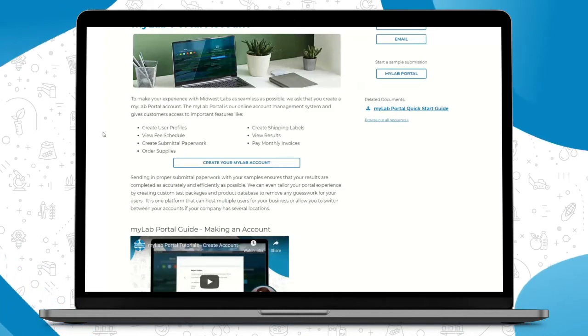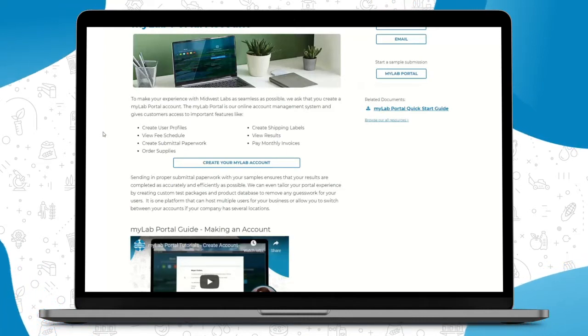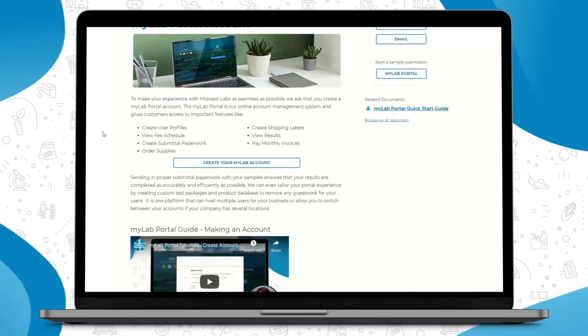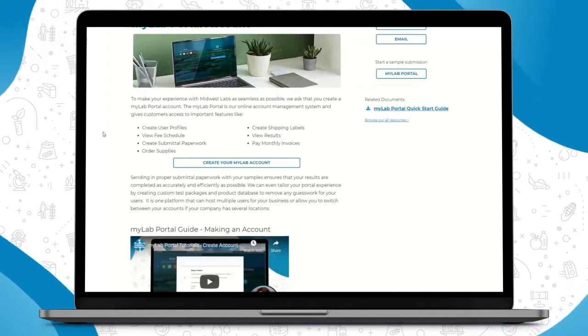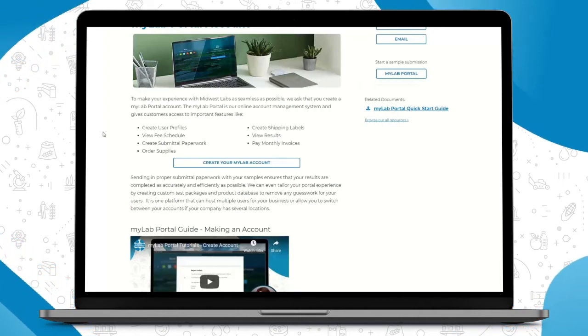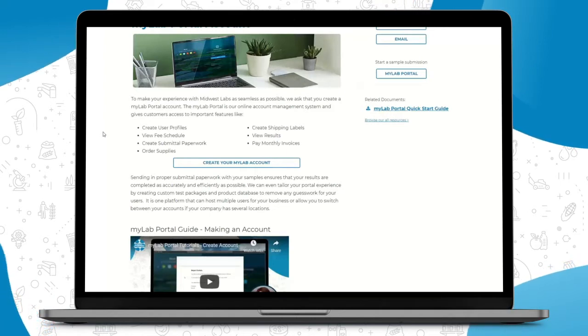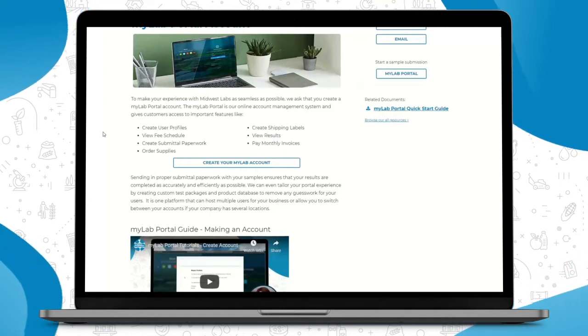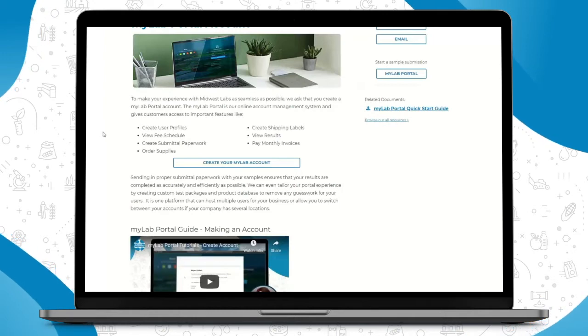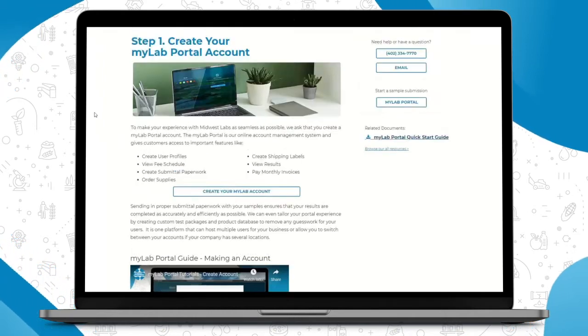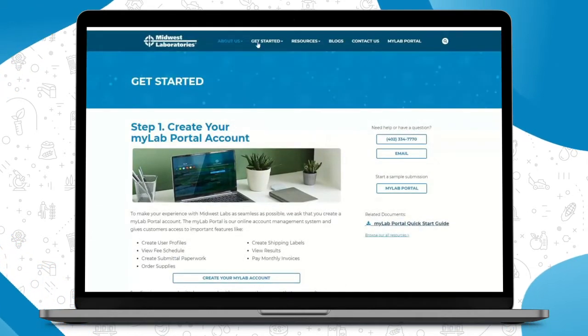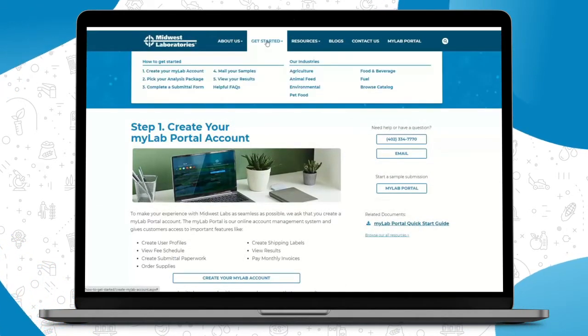Viewing your fee schedule, creating your submittal paperwork that you send in with your samples to us, ordering your supplies, creating your shipping labels to print off, viewing your test results, and conveniently paying your monthly invoices securely online.